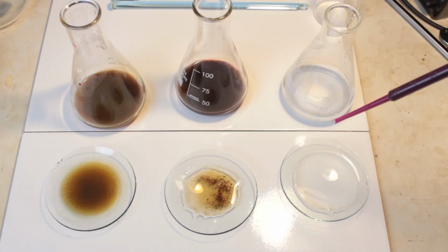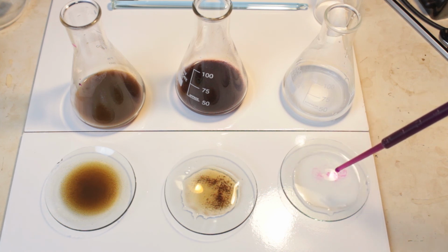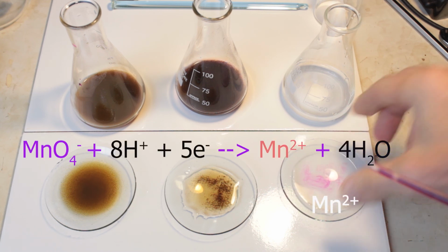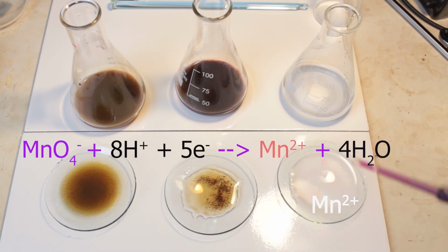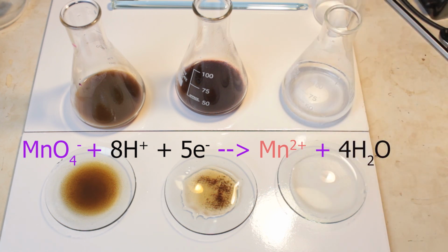You see, during titration, I put oxidizing agent into reducing one, and the color would disappear if there is enough reducing agent in. Yeah, purple manganate 7 into colorless manganese 2+. End point of titration would be permanent pink color remaining. It means all reducing agent is gone.